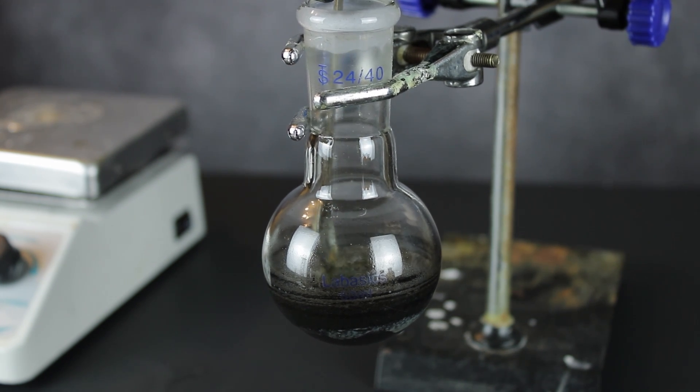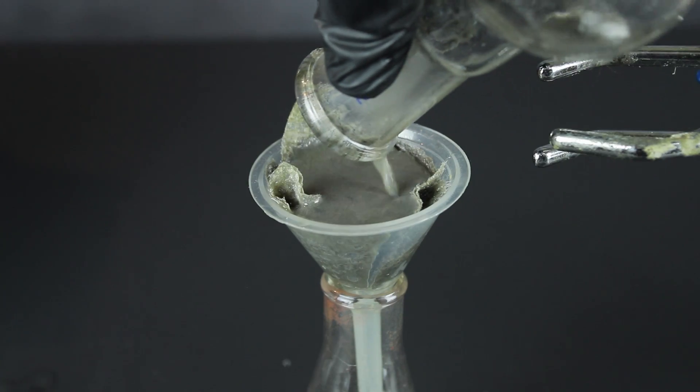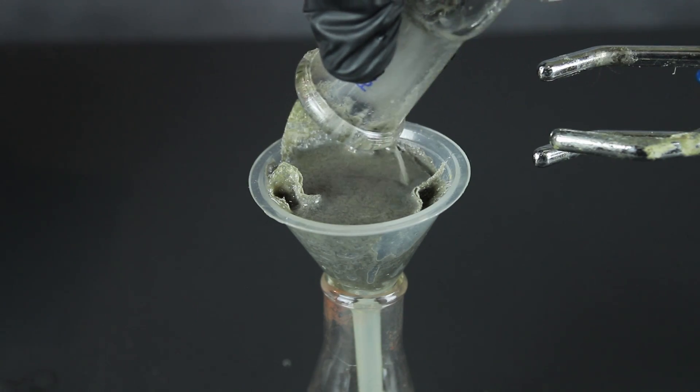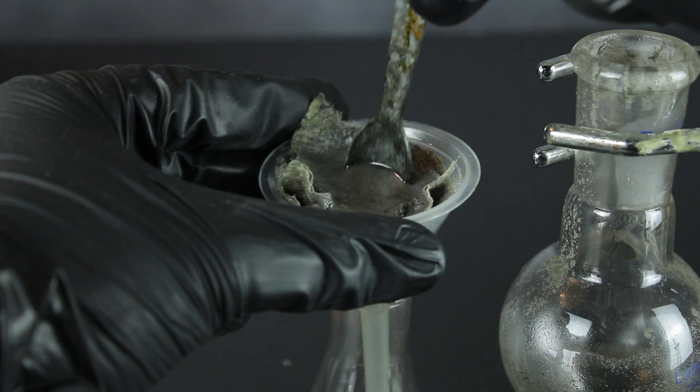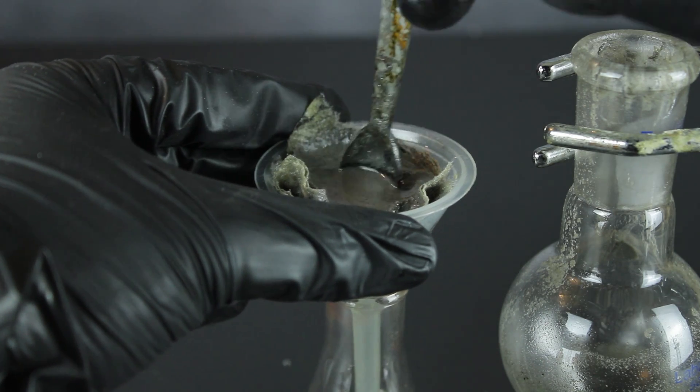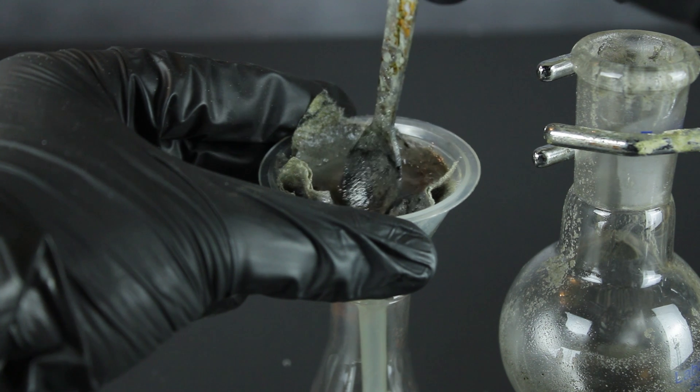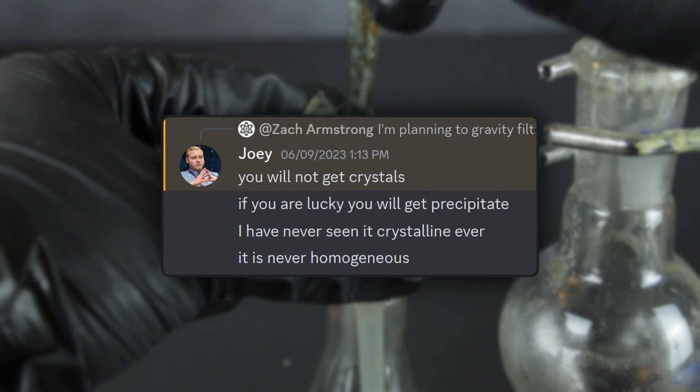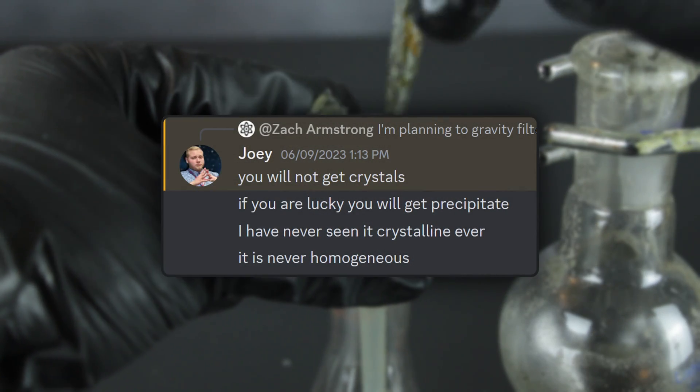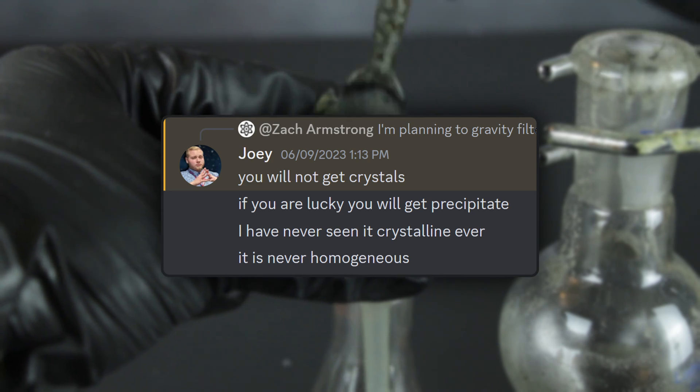This is our crude Lawson's reagent, which I filtered off and washed with two 10 milliliter portions of diethyl ether. Now, at this point, the paper simply calls it good enough and doesn't bother purifying the product further. But as you know, I like myself a good challenge, and according to YouTube's resident sulfur chemist, recrystallizing this stuff is pretty much impossible. We'll see about that.